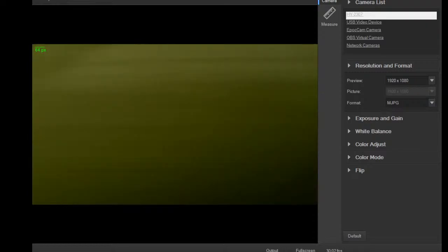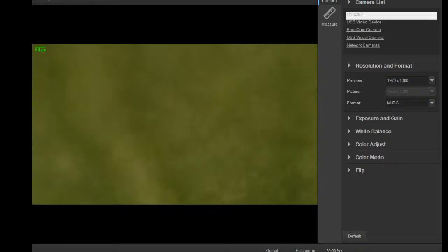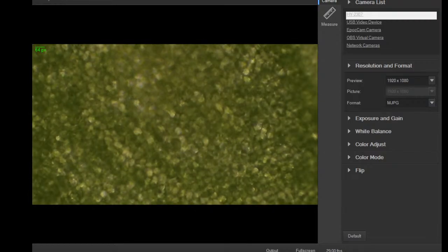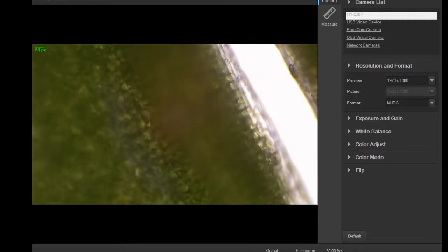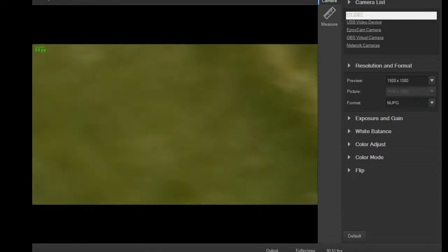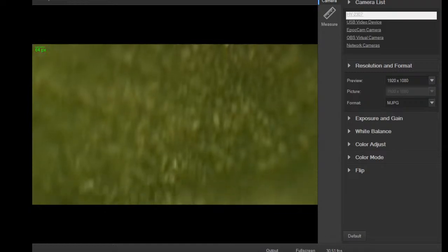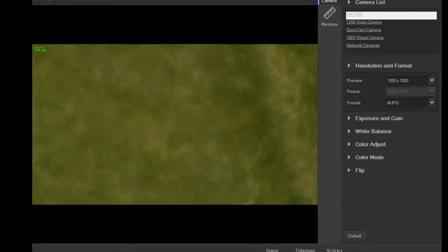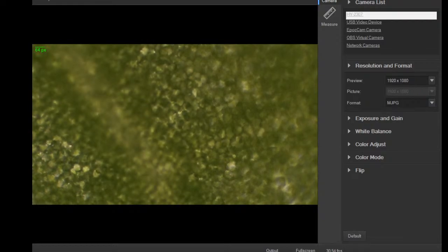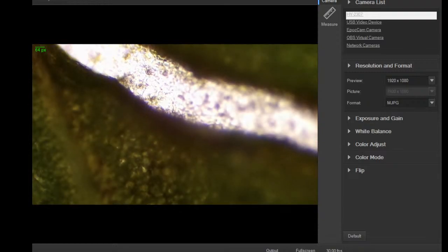I'm going to try and go a little bit closer, see what we can see. So now we're getting into individual cells. Try to find a flat part. The problem is, unlike some types of algae you find in the ocean, like certain kinds of kelp type things, like this one called sea lettuce, or, well, I can't think of the common name. It's called porphyra, but some of those can be extremely thin, kind of like the stuff they use for nori, seaweed wrap for sushi and stuff. Extremely thin, and there are certain species that are basically like a cell layer thick, but this is not. This is a little thicker than that. As you can tell from the cut here, you can see there's some thickness to it.